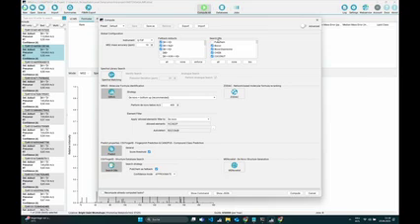So for example, if you want to do spectral library search, you would want to enable the spectral libraries that you have loaded in beforehand. I don't want to go into this in too much detail, but one thing that is also new is this bar for presets.